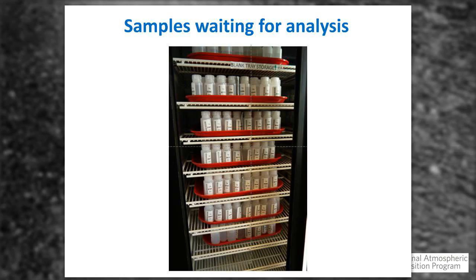For operators as well, if you have a bucket that you put on a collector and it does have some residual wash water, we aren't able to dry the buckets before we ship them to you. So carefully try to shake out any residual water out of both the bucket and the sample bottle.